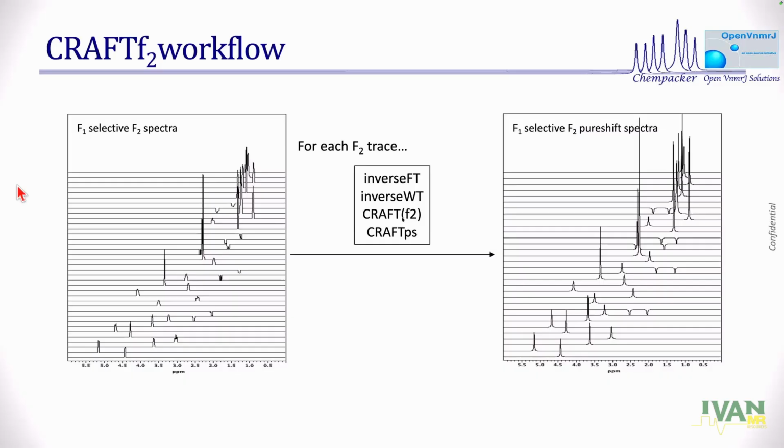And then it's a single group of F2 vectors that precess around its correlated F1 chemical shift. I don't even have to think about whether other cross peaks are contaminated in there, because anything that is contaminated is only what I cannot resolve in this entire 2D. What I cannot resolve both in F1 and in F2 means the correlation experiment that you use is not good enough.